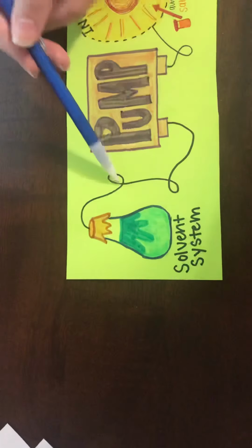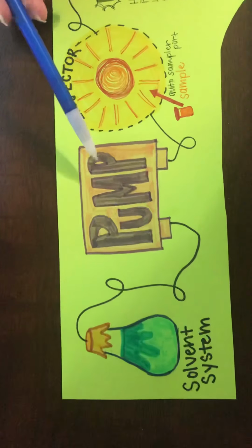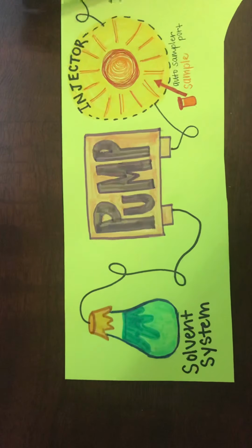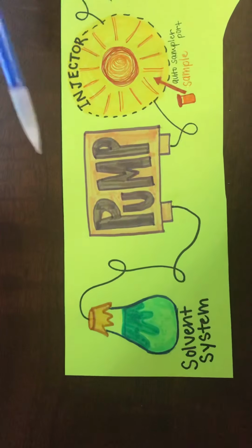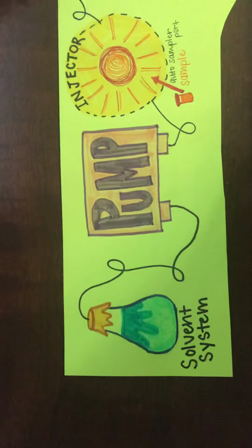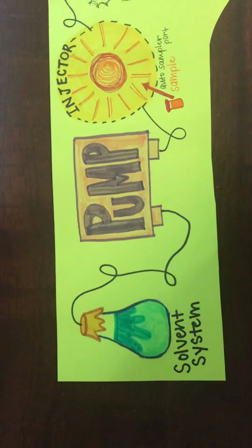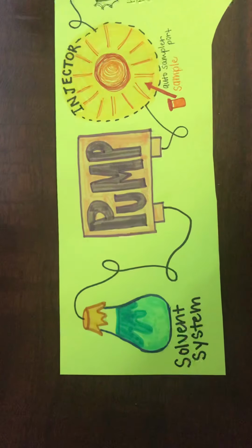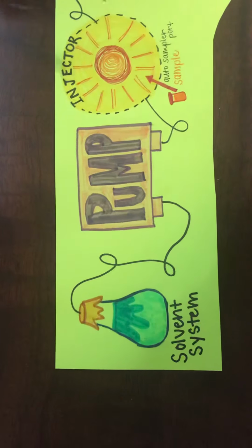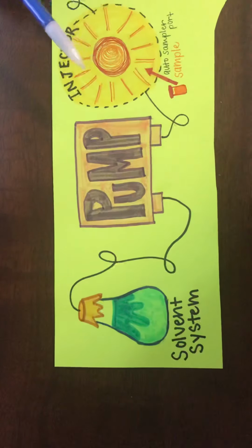So from our solvent system, we go to the pump. So at the pump, we deal with the dense stationary phase in the column, so that we need pressure to push the solvent and our sample through the stationary phase quicker. And at most universities and at TU, the amount of pressure that we are using to push our solvent and sample through the stationary phase quicker is a range between 300 to 400 bars.